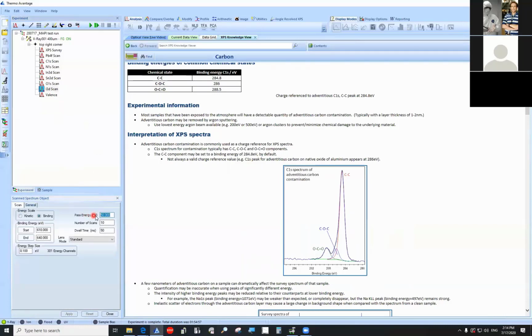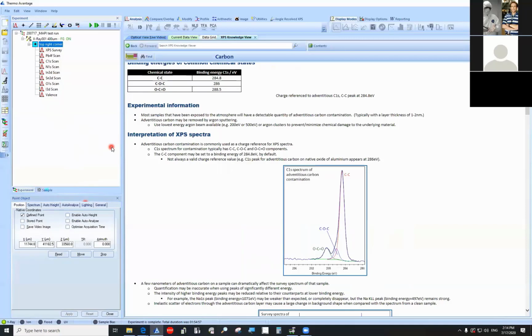But ultimately, what your group is going to want to do is generate this kind of experimental setup or outline or workflow, and just use that same data collection methodology each individual time. The only thing you'll have to do is update your actual position for a new region of interest on your specimen. Or you could copy all of this and make an exact copy for a new data point at a different position on your specimen. Maybe you want to do center and edge. I don't know, right? Because these are spin cast films, there could always be some difference.